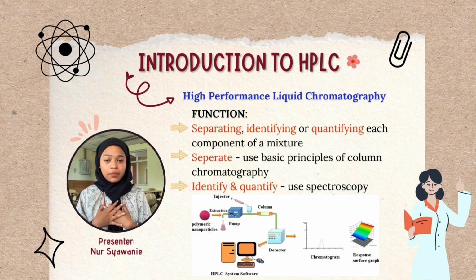I am Nur Shawani binti Abdul Aziz and I will be presenting the introduction of the HPLC. First, HPLC is an abbreviation for High Performance Liquid Chromatography. It is a technique for separating, identifying or quantifying each component of a mixture. The mixture is separated using the basic principles of column chromatography, then identified and quantified using spectroscopy.